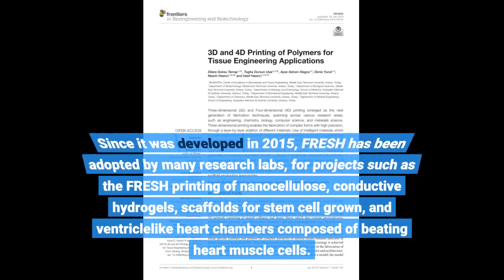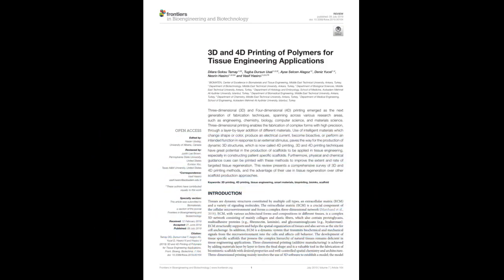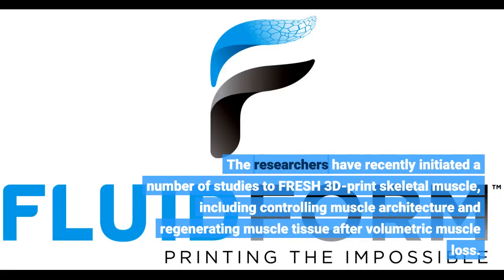Since it was developed in 2015, FRESH has been adopted by many research labs, for projects such as the FRESH printing of nanocellulose, conductive hydrogels, scaffolds for stem cell growth, and ventricle-like heart chambers composed of beating heart muscle cells. The researchers have recently initiated a number of studies to FRESH 3D print skeletal muscle, including controlling muscle architecture and regenerating muscle tissue after volumetric muscle loss.